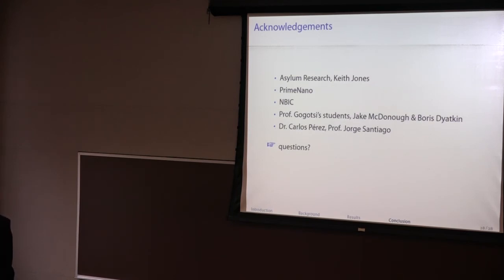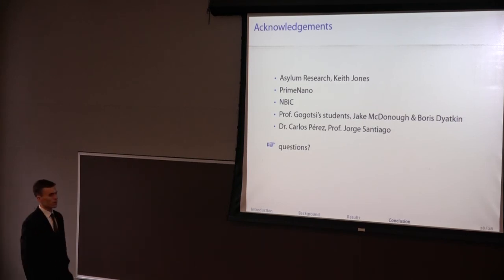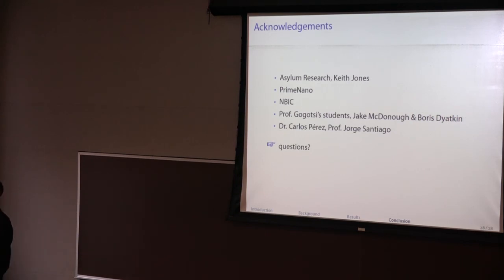So I work with magnets, particularly trying to look at the nanostructure of the magnets after I have imaged them. So I'm curious if this method would be able to show that at all. I don't think it's particularly sensitive to anything like magnetic fields, really. But if you have some kind of phenomenon, like I mentioned with the example for the domain walls, where your magnetic material is giving rise to different electrical behavior, I see it being sensitive to that, but without knowing more about your system, I can't really say. Okay.